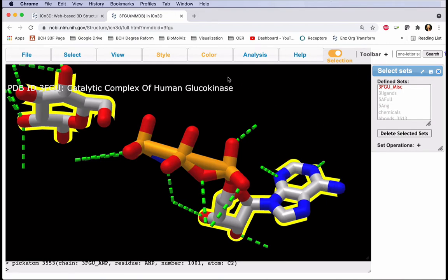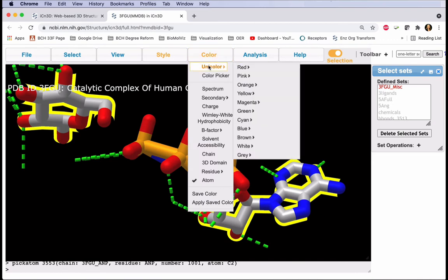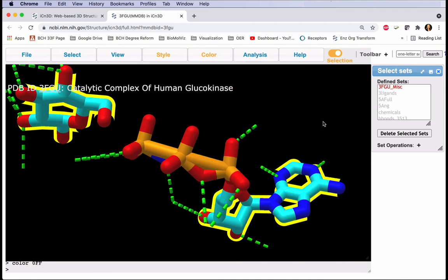With all of our carbon atoms now selected, we can color them by unicolor, and let's make them cyan.